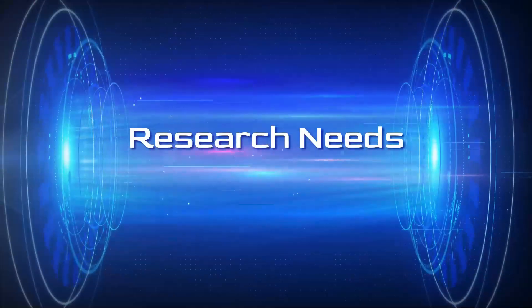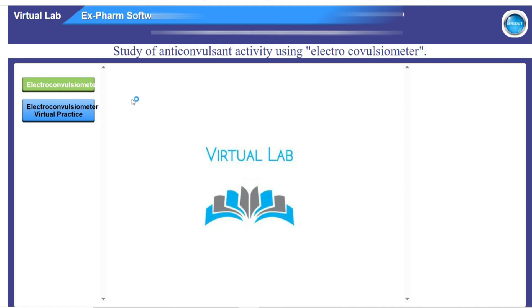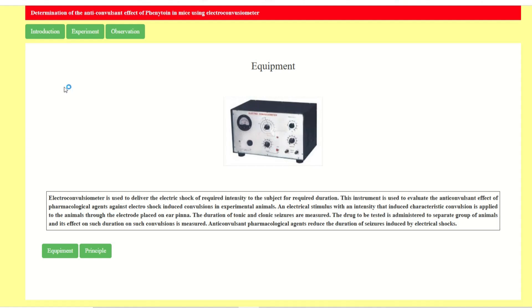Hello friends, welcome to Research Needs. Today in this video we will see the study of anti-convulsant activity using the electroconvulsiometer. We will enter inside the Ex-Pharm software. After entering inside the Ex-Pharm software, we found this type of interface. Now we will click on the electroconvulsiometer virtual practice and found here to perform the experiment.